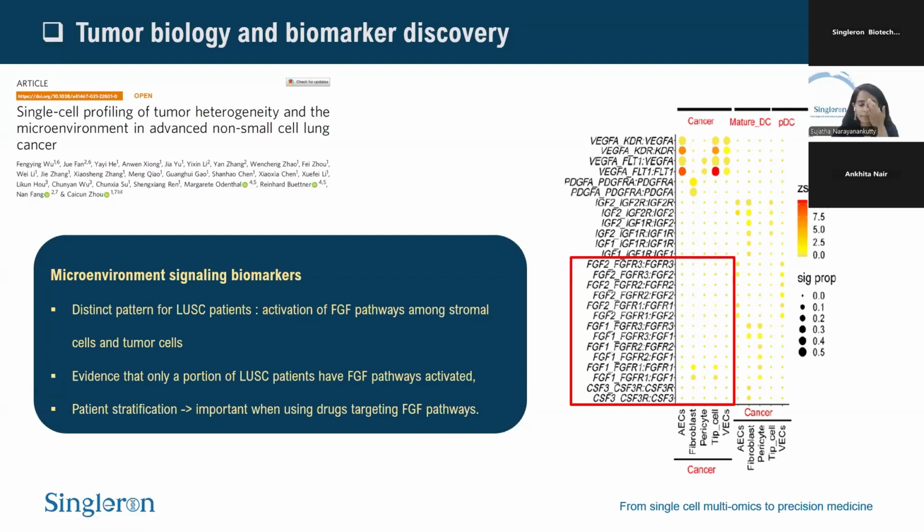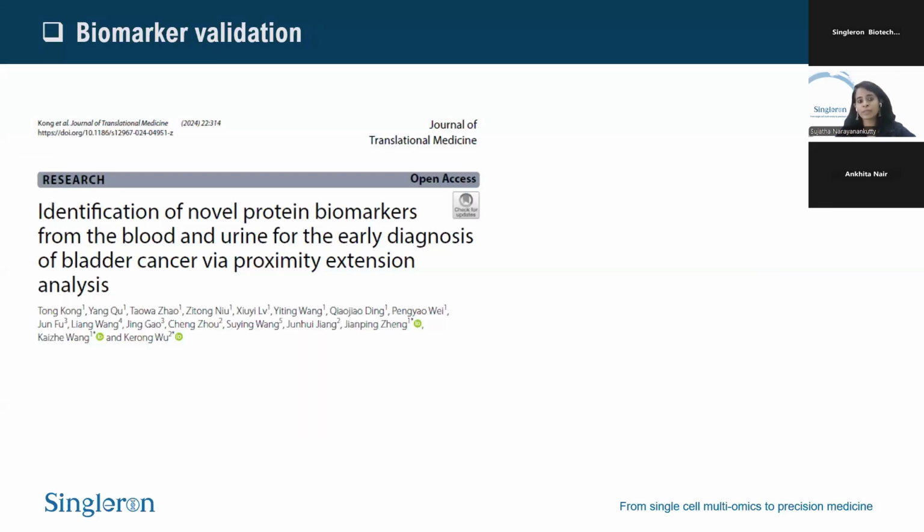And so all of these insights into the particular disease come about when you do in-depth single cell sequencing of the sample and then understand both the cancer cell types, the immune profile, and all of the cell signaling between these types. So this is discovery based. You're just digging into the different cancer tissues and figuring out what the biomarkers are. You can also use single cell for validation.